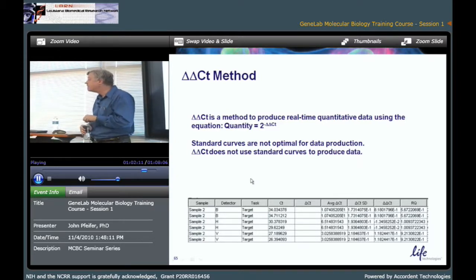So what do you normally use for absolute calibration? What are the internal standards? Okay, now of course the absolute calibrator will depend on the type of result that you want. For example, if you wanted to do absolute gene expression, if we want to know the molecular concentration of the messenger RNA on a nanogram basis of total RNA, in that case, what I would do is make in vitro transcribed RNA for my target. For example, Ambion has a kit called Megascript that does that sort of thing.